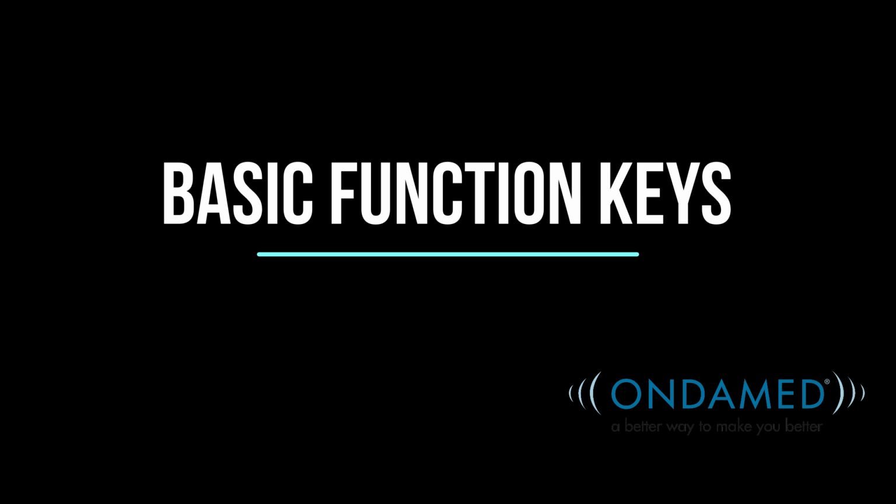On the left side, let's assume we're in Module 1. You want to go to Module 1? One moment. Of course, you have the option to switch on and off the auto record, it's called. So if you don't use it, of course, you keep it switched off. So why would people not use it? If they don't want to keep a record? Keep record, of course. But they want to use it for visualization.